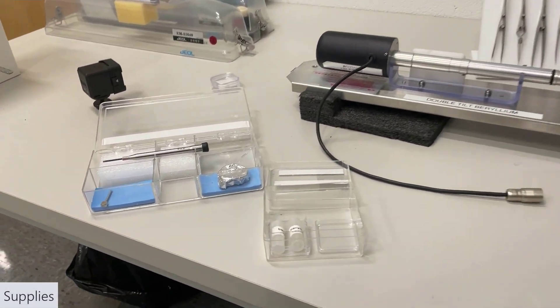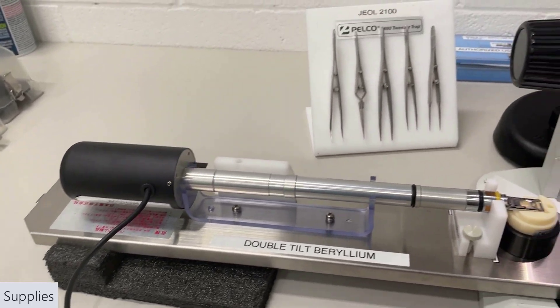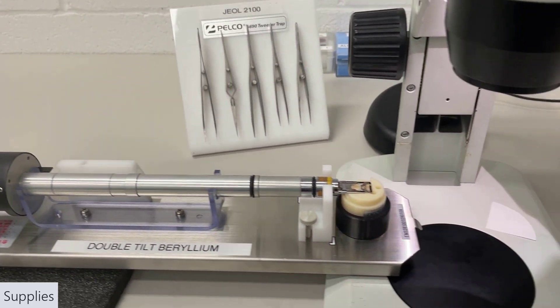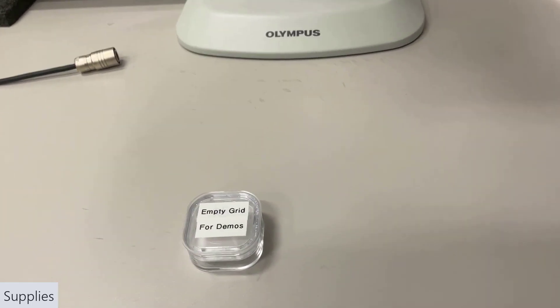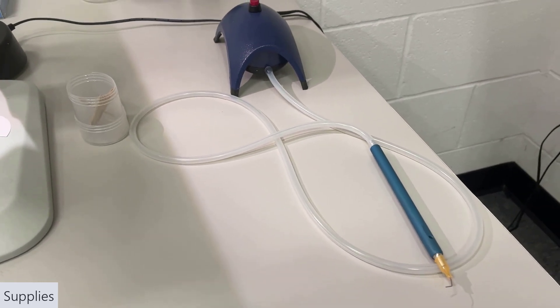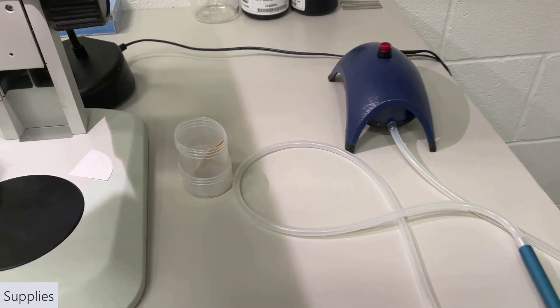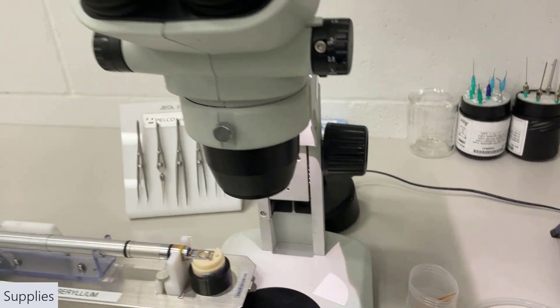First off, we need to gather supplies. Depending on the scope you use, those may be different. We'll need tweezers, your sample of course. Vacuum tweezers are optional, but I find them to be very useful, and some toothpicks and a binocular scope to help you see what you're doing.